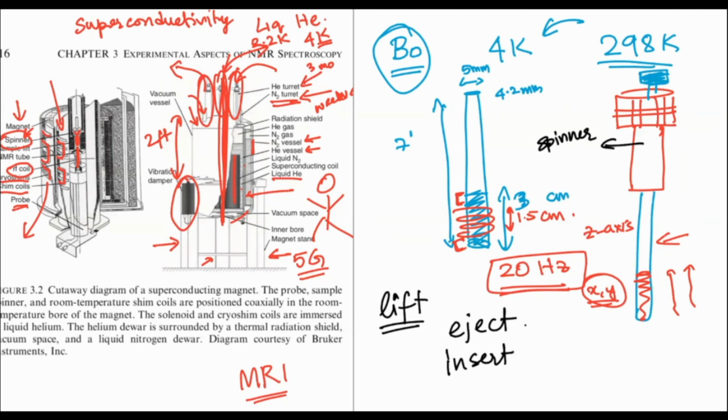So what is the main difference between solid state NMR and solution state NMR? Is it based on the probe that we are using in both? A lot of differences, except for the magnet. Even the magnet, the way the bore is present, wherever the bore is where your probe goes in. Generally, solid state NMR spectrometers have something called a wide bore because their probes are very different in size from solution state. So that is one of the main differences, but there are even more differences that come up.